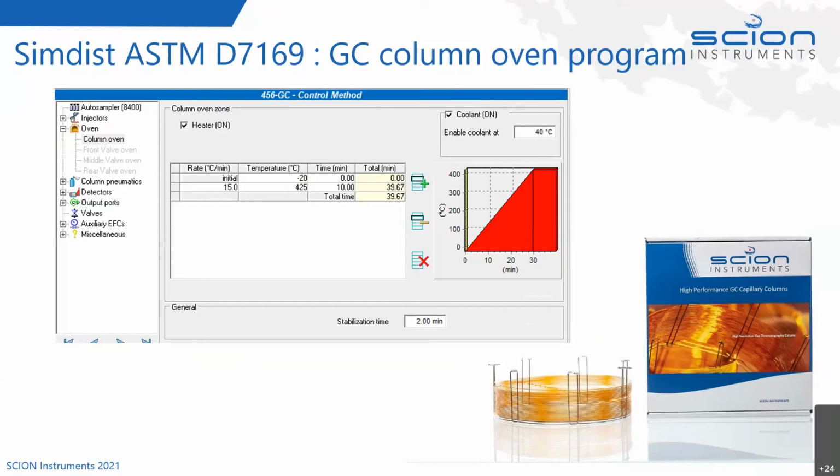And it's really quite a high temperature. This is why the DHA column will be fitted in a separate GC. It just can't handle that high temperature at the end.